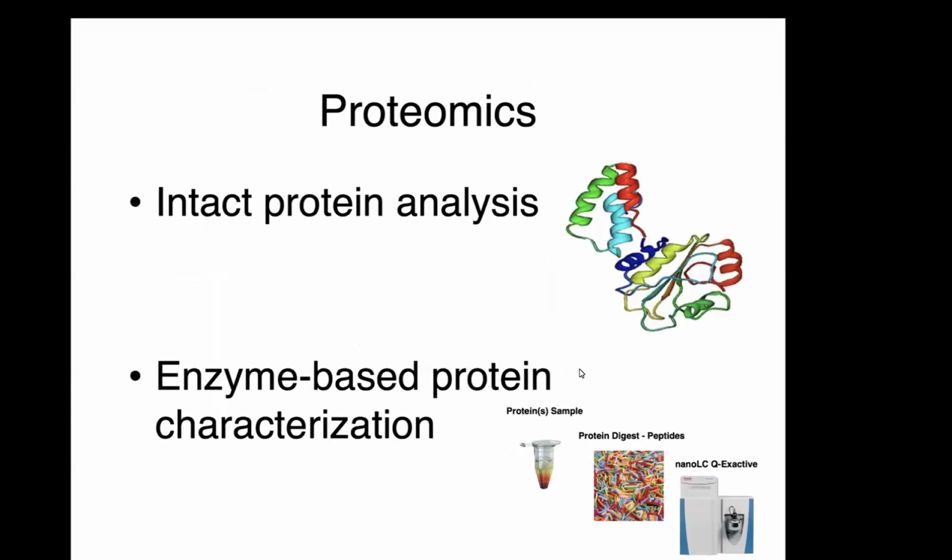Thank you, Elizabeth. So just like Elizabeth mentioned, our second approach for proteomics is enzyme-based protein characterization, which includes the digestion of proteins into small peptides using a specific enzyme.